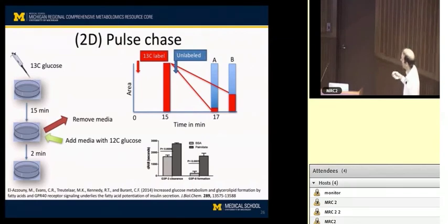forms. That can be quantitated as a rate, and we can say that the clearance of glycerol 3-phosphate was higher under, so these were, unfortunately Mako didn't put this in here before, these were serum and palmitate treated cells. Palmitate treatment increased the rate of glycerol 3-phosphate clearance, but it even more dramatically increased the rate of glycerol 3-phosphate unlabeled formation. So we were able to tease apart these two components, whereas if we were just doing a standard time course, that might not be feasible.